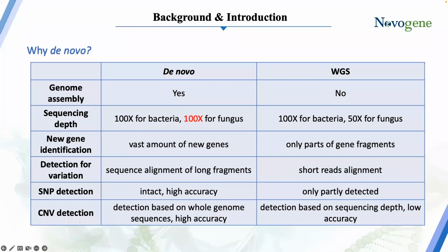The reason that I also recommend pursuing Illumina sequencing for your de novo assembly is because Charles touched on this a little bit. The accuracy of long read sequencing technologies, while it is long read and it's great for assembly, there is some trade-off in the accuracy of the base calling, right? If you're going to phase alleles, you should use something like PacBio Hi-Fi, for example, where there's circular consensus reads that build a consensus sequence that is also a long read. So you have some redundancy there that's built into the long read platform. And then you can validate those different SNPs that you see using Illumina sequencing too, and kind of build your confidence of your base calls by layering Illumina reads.